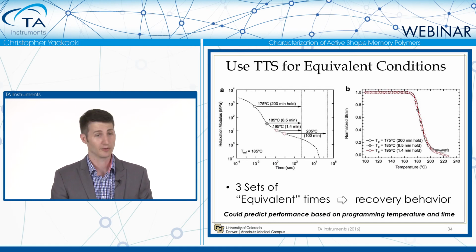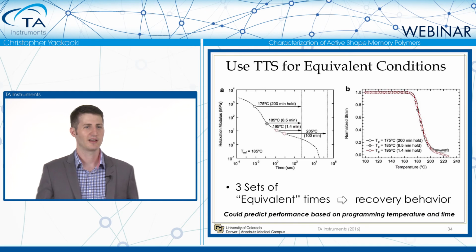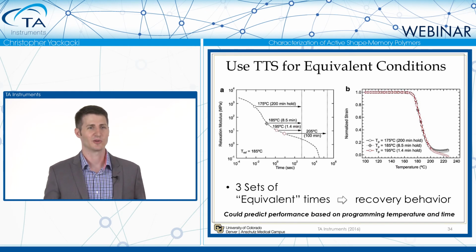I'll look at the results of that real quick. And what you can see is for those 3 equivalent times and temperatures, their recovery response was pretty much identical, right? So it initiated recovery at the same time, its recovery rate was the same. They both recovered 90, 95% of the stored shape.